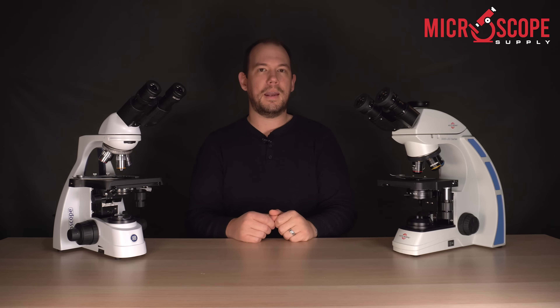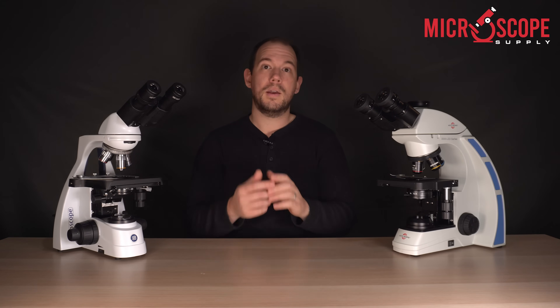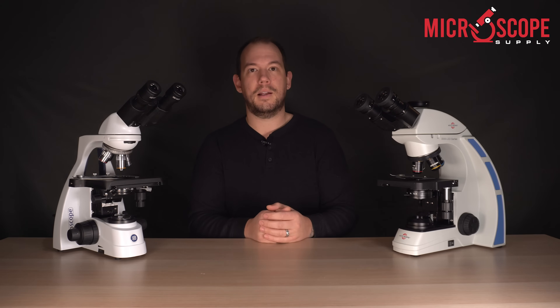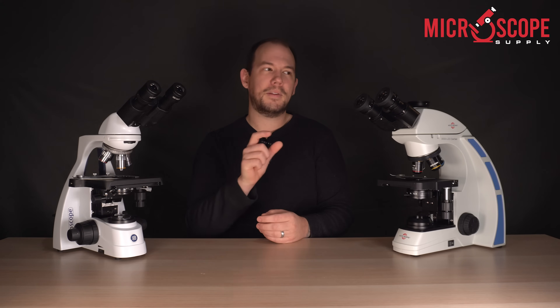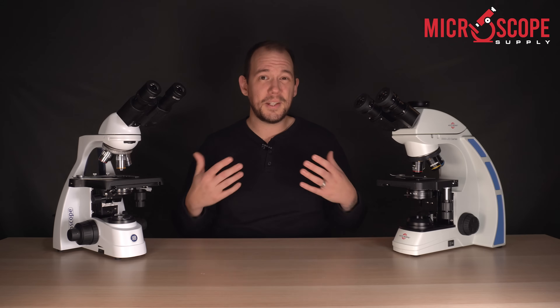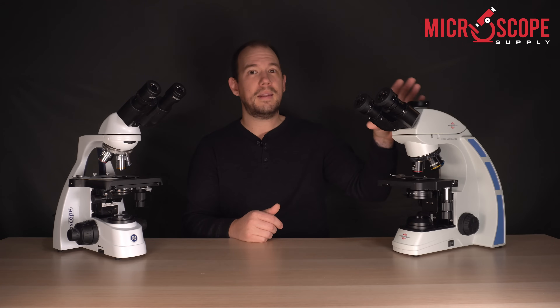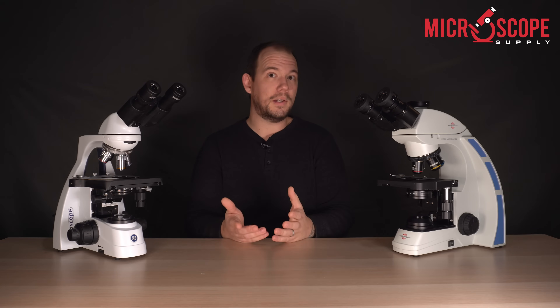Most dedicated microscopy cameras use a C-mount, and most microscope models come with several different C-mount options paired with a certain sensor size for the camera. There are also DSLR mounts available for some microscope models, not all. So if you plan on using a consumer camera with your microscope, you'll have to make sure that a specific mount is available for that DSLR. It's always best to plan ahead — if you think you'll need a camera in the future, go ahead and spend the little bit of extra money to get the trinocular head; you will save yourself money in the long run.